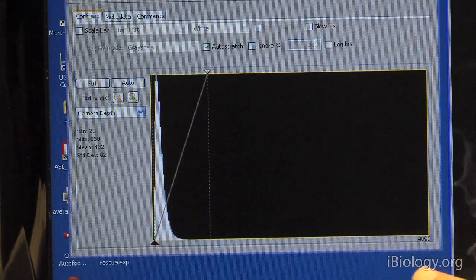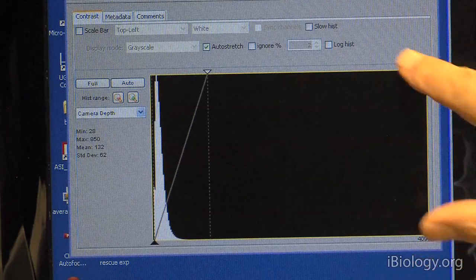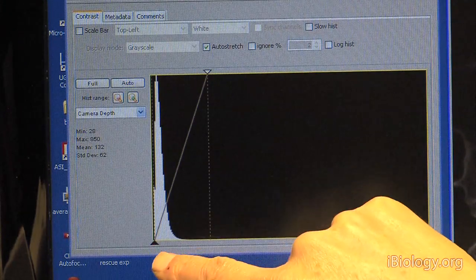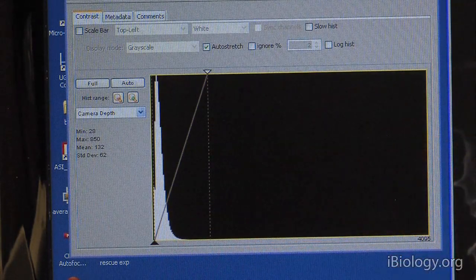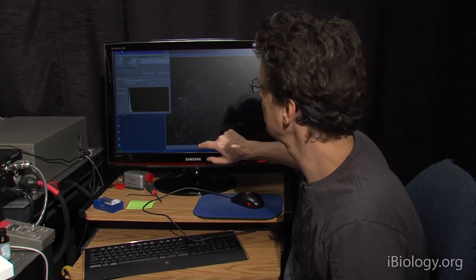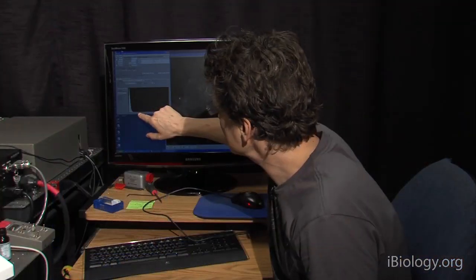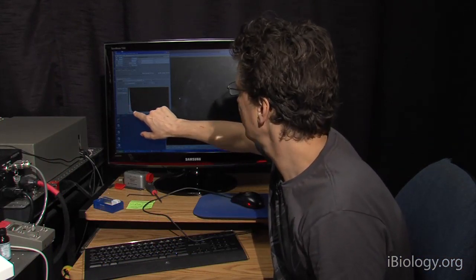This part of the screen shows two different graphs all together in one. And it's very useful to have them both together. One is a histogram that has the grayscale values that the camera can produce on the x-axis. And then the number of pixels at each of those bins of grayscale values on the y-axis. So, from this we can see that the histogram mainly has relatively low pixel values. We're very far from saturation of the camera.